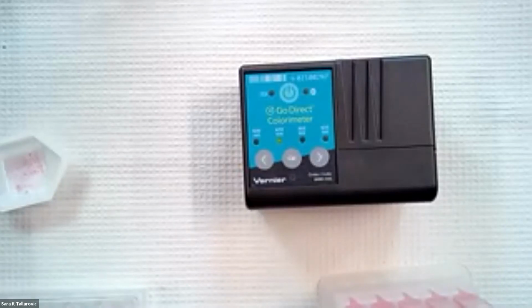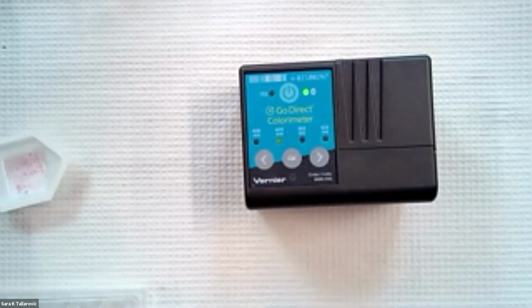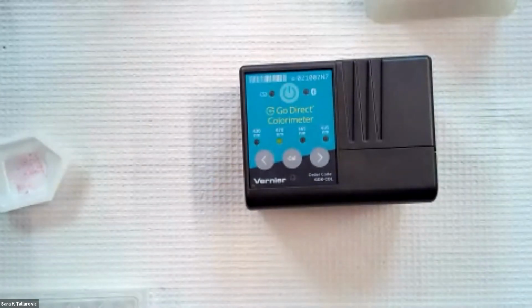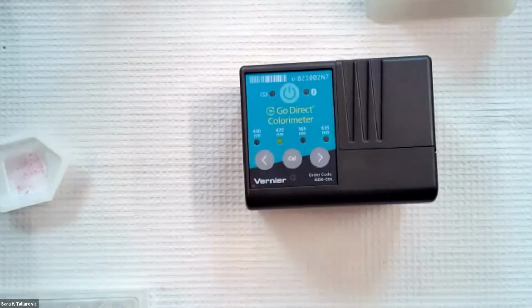All right, so I'm going to show briefly the effect of alcohol on membranes, which is actually lab 8 out of the Biology with Vernier book, but the results are always kind of fun for this lab exercise. Feel free to keep asking questions as I do this. This will not take terribly long because I've just got one set of samples, looking at isopropyl on membranes.